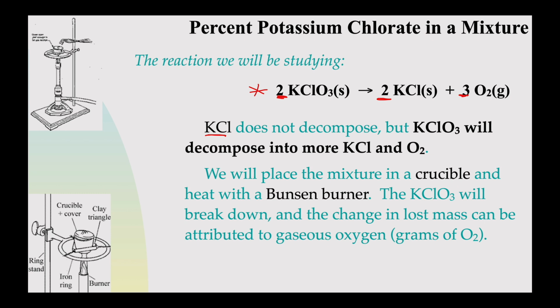It's a very stable and inert compound, not very exciting, all right? But the KClO3 will break down. It's going to break down into more KCl, and oxygen gas is going to come off too. It actually is going to bubble a little bit.